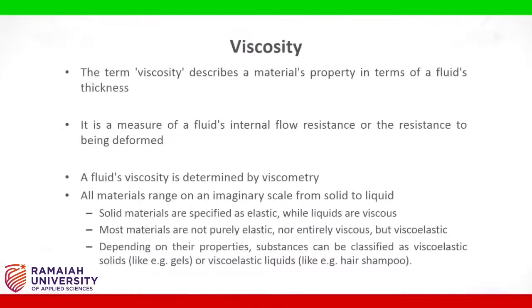The term viscosity describes a material's property in terms of a fluid's thickness. It is a measure of a fluid's internal flow resistance, or the resistance to being deformed. A fluid's viscosity is determined by viscometry.